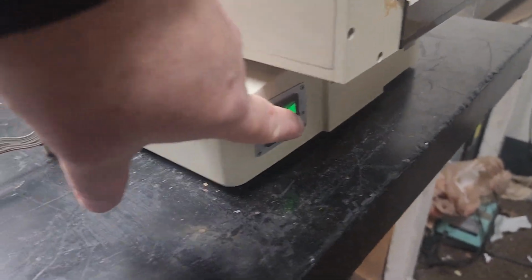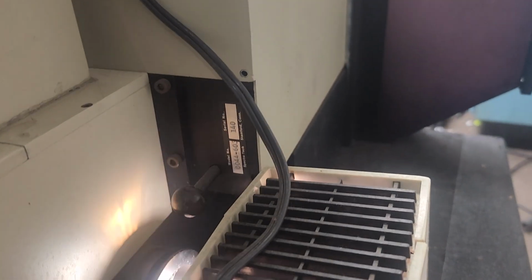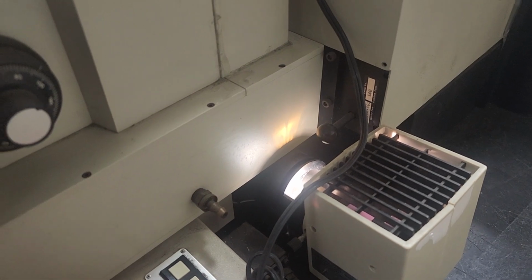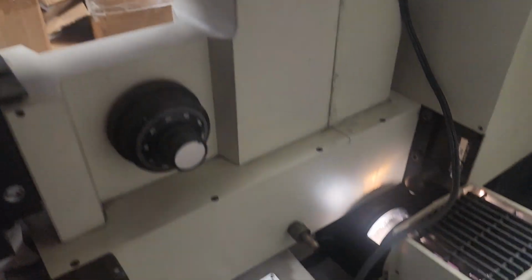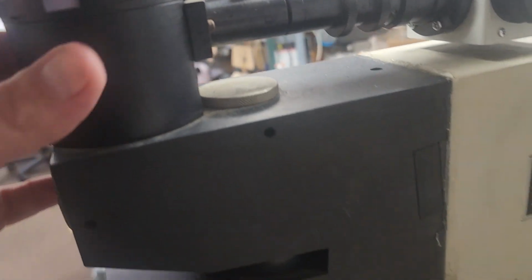Then here's the main power. That seems to work. I'll come around here. This part here dims this light. And this appears to be plugged into the power supply. Oh, and this says objectives, so maybe this changes the objectives? I'm not sure.